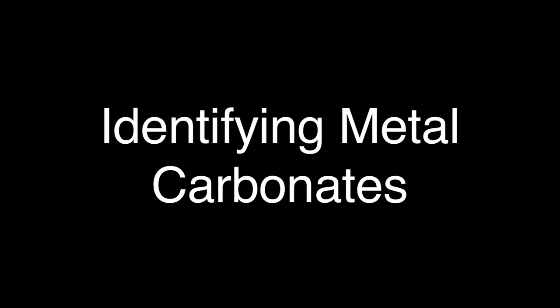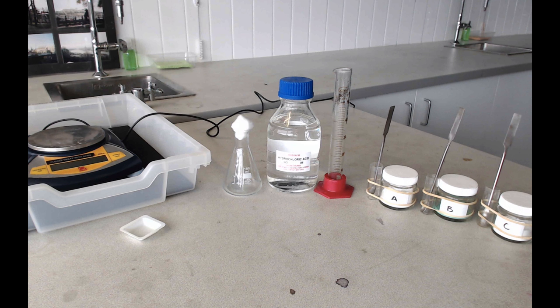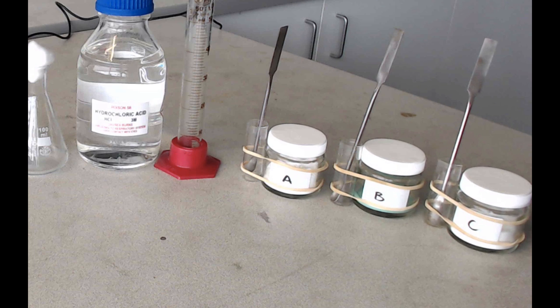Hello and welcome to this film which is all about the practical called identifying metal carbonates. We're going to need some metal carbonates in this experiment, and they are kept in three marked jars, but the jars are only marked with the letters A, B, and C so that you don't know what metal carbonate is in each one.